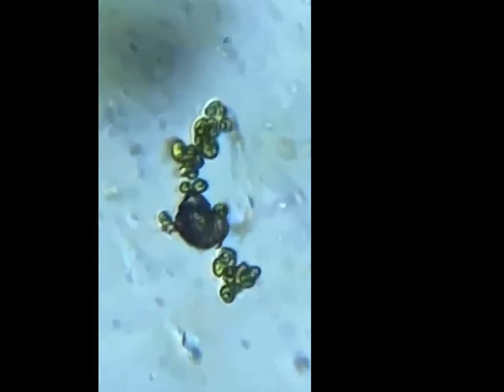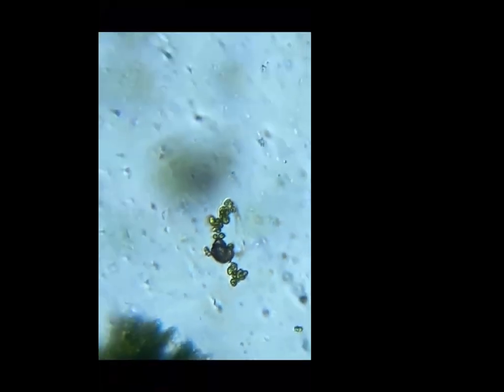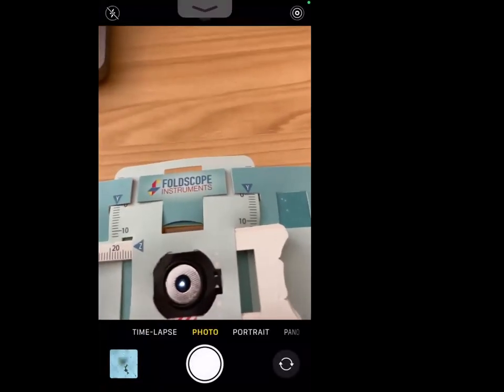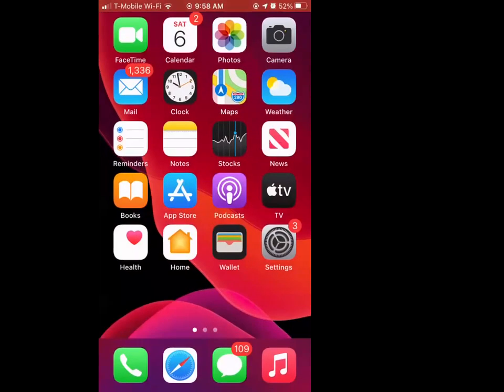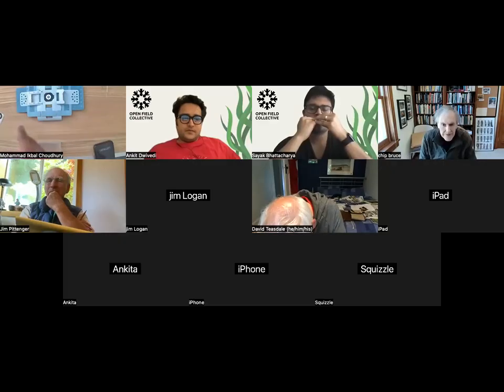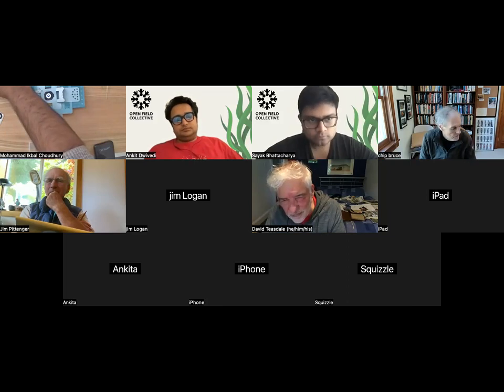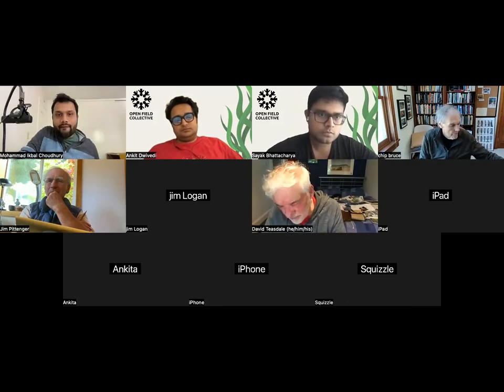Okay, so what is this? Now I can do further zooming. I don't know, honestly, but we can find out with the resources that we have on the website. Okay, how do I go back? All right, then let me switch to the other camera. Okay.